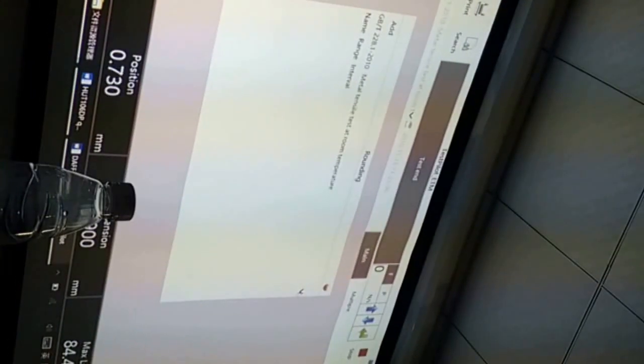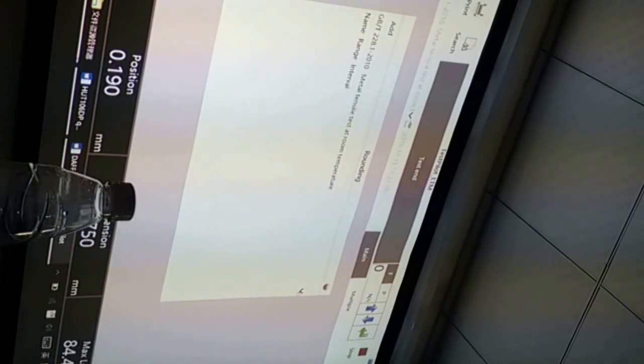What else? And rounding. You can choose a standard rounding method. I mean, how to calculate very long. Could you help me explain the rounding method? Rounding method is a little difficult.